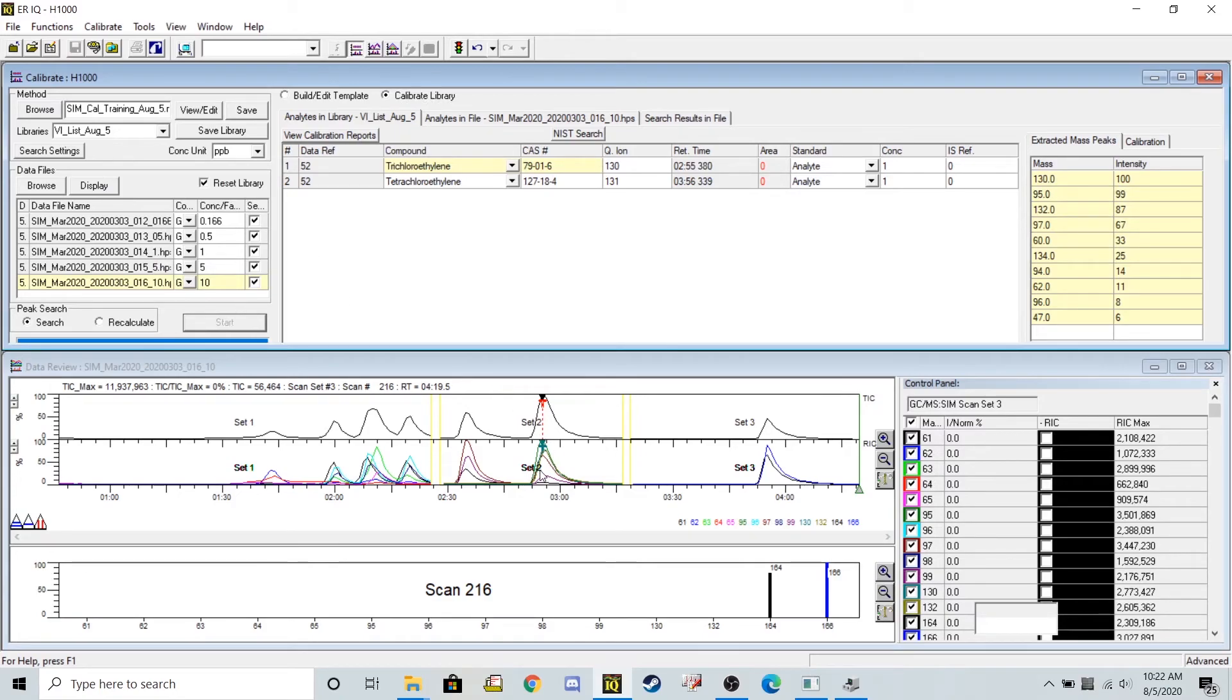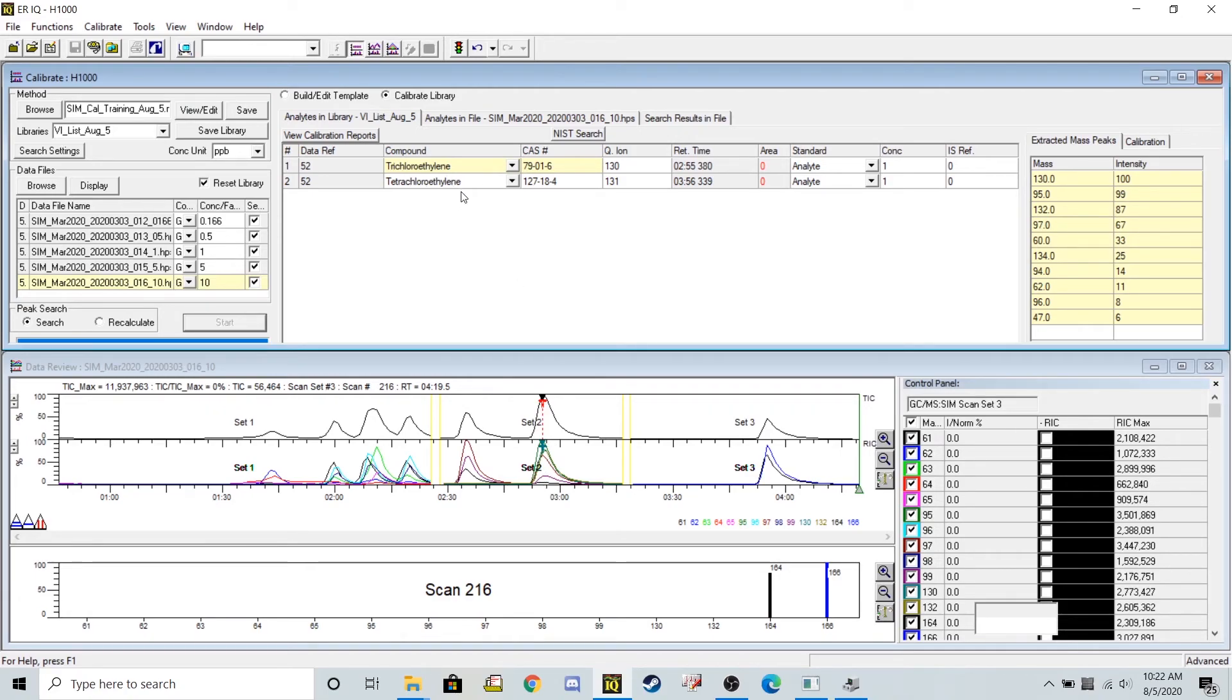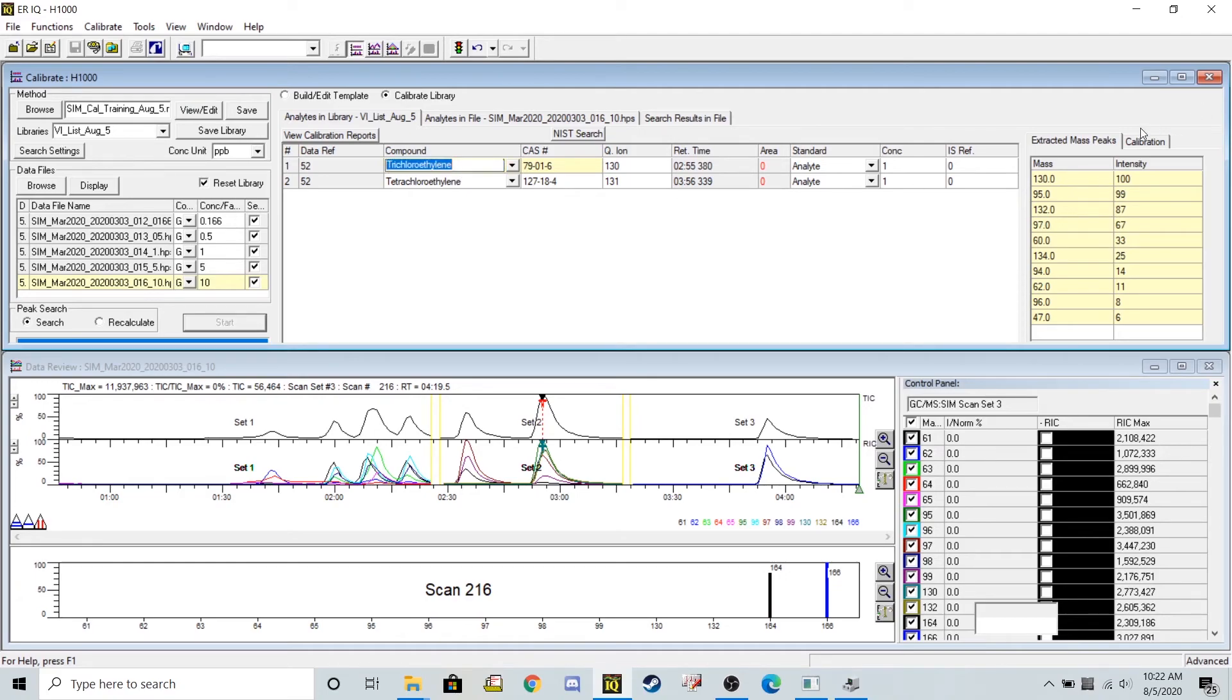At this point, you can see where it flagged your first chemical of interest, but notice I mentioned that we'd make a mistake earlier in the method, and we'd have to fix it here. Our second one, trichloroethylene, has a nice calibration curve going evenly.